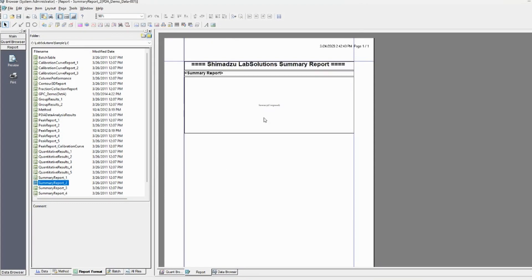So there's two ways of doing it. You can either have a blank template and drag from above to customize, or just pick one of these templates on the side. Shimadzu always gives you like 40 ways to do one thing.